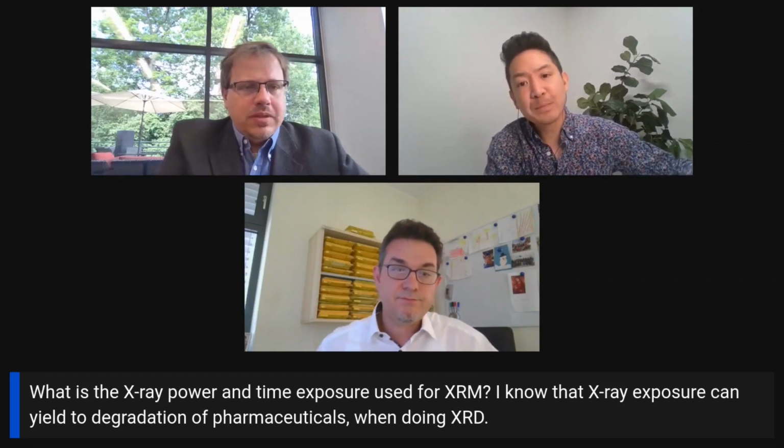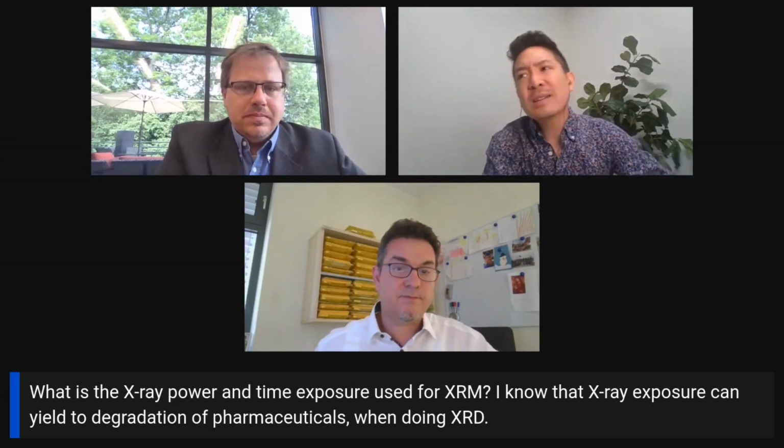Okay, so Nate, what about the XRD side of things? Yeah, so I think that often people, say at a beamline, a synchrotron, a very, very intense X-ray beam, certainly you could see some browning and some damage to the sample. I think in a laboratory setting, we often don't see this. We don't see it frequently.